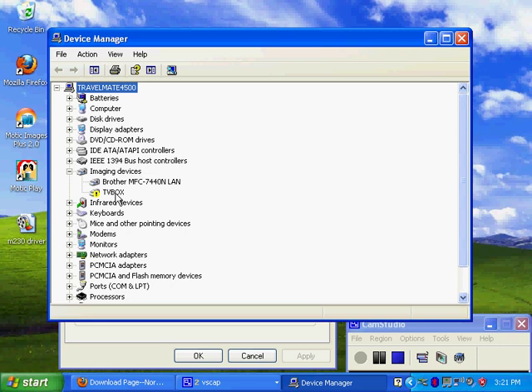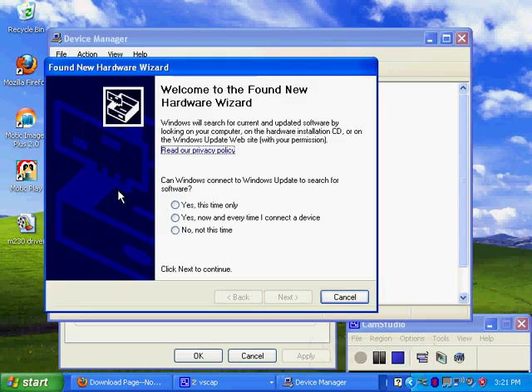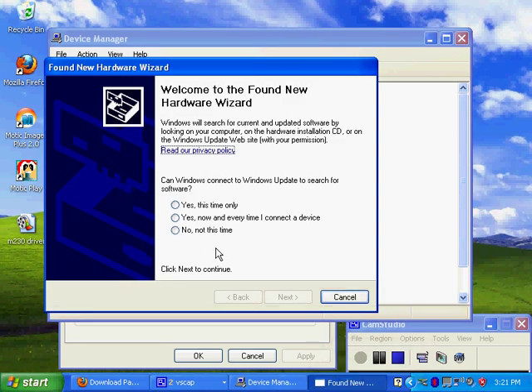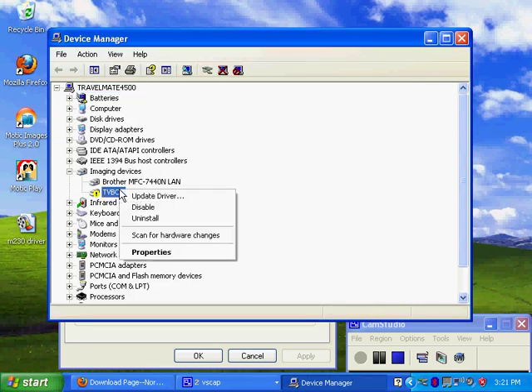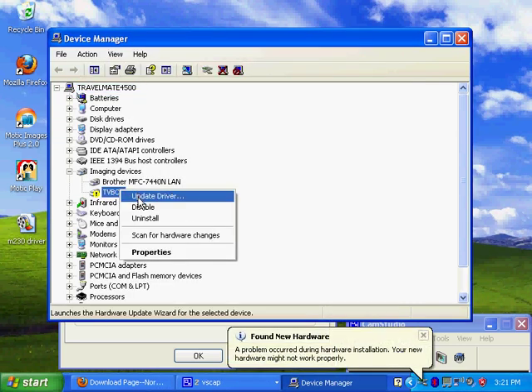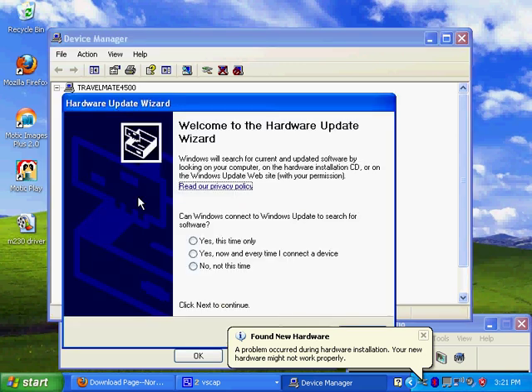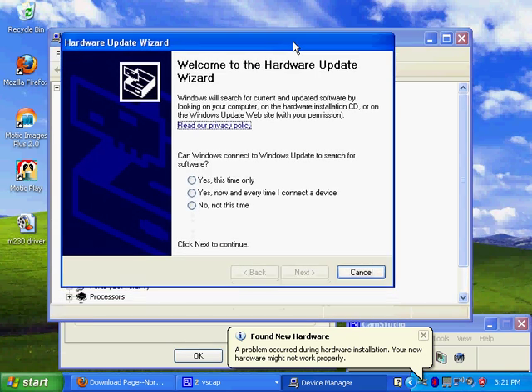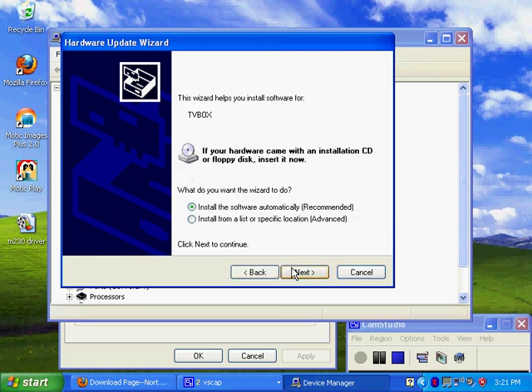Now, to install the driver, right click on whatever your product name is, and then click on update driver. This will pop up the same hardware update, but now we are sure we are installing to the correct device. Click on no, not this time, and then click next. Click on install from a list of specific location, and then click next.